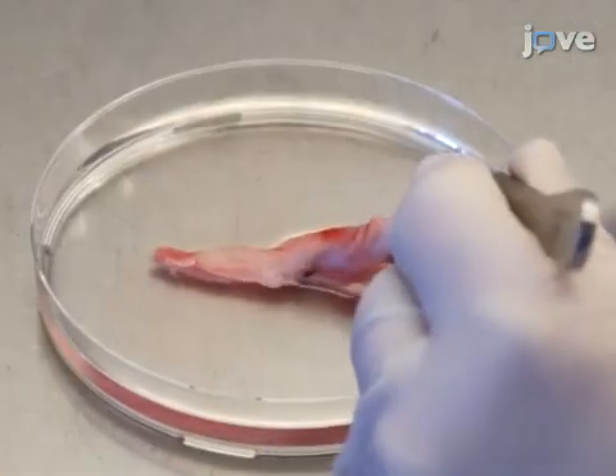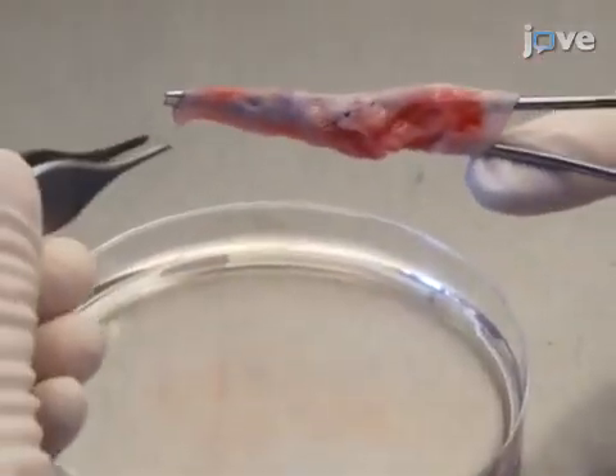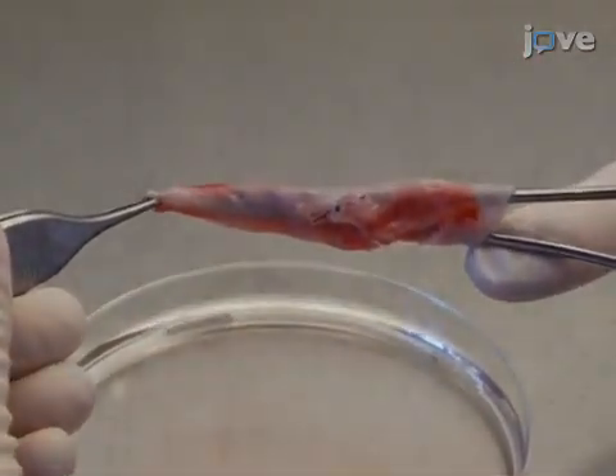With a curved Halstead Mosquito forceps, carefully enter a vessel end, clamp the tip of the forceps at the other end of the vessel, and then retract, slowly inverting the vessel.